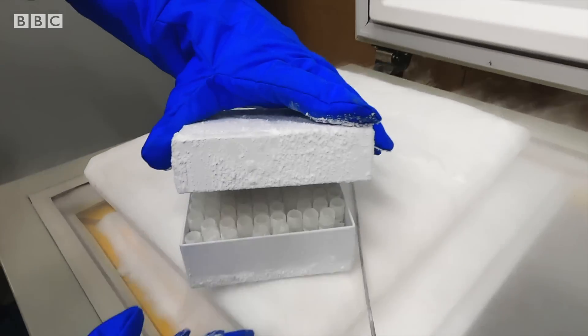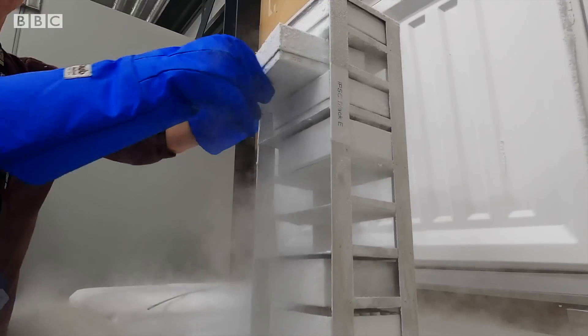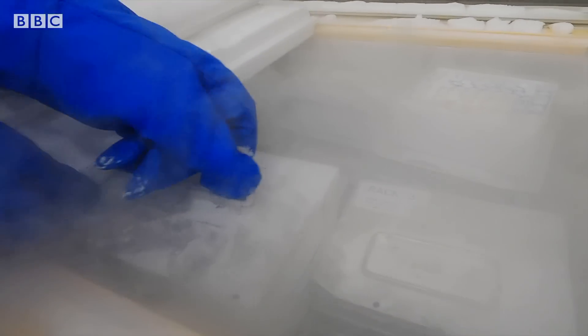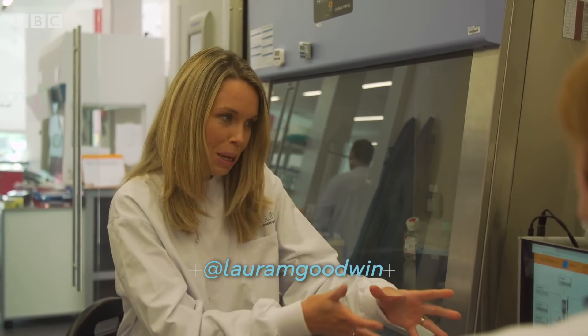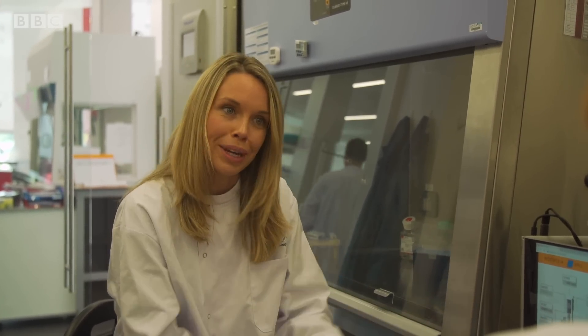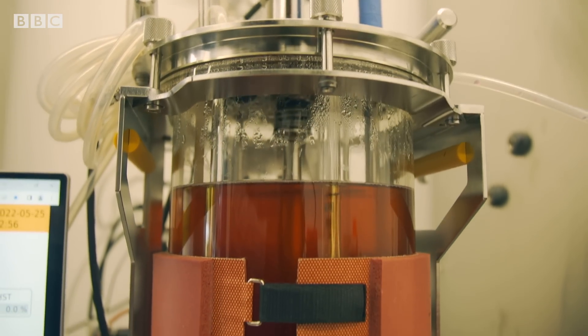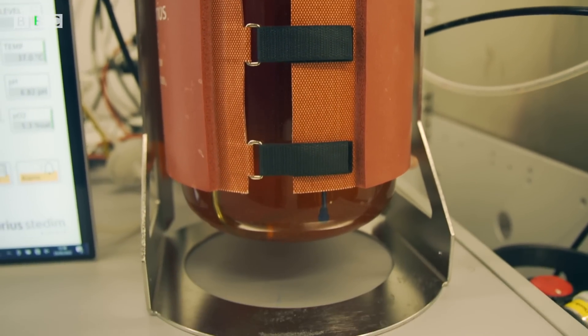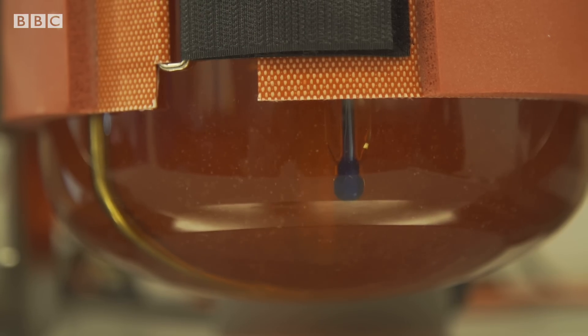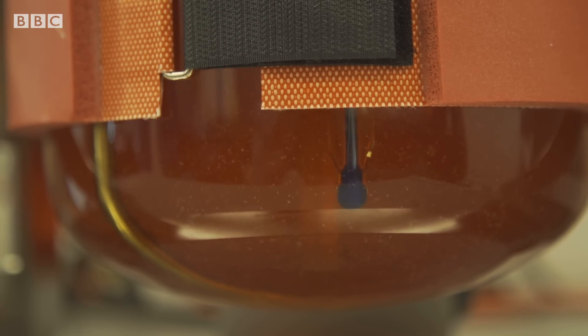The cells are frozen and packed, ready for shipping to lab-grown meat companies all over the world. We've come through here to see the next part of the process. This piece of equipment is a bioreactor, similar to what you get on a much larger scale in a brewery, for example, where you can take lots of cells and amplify them. Our goal here is to get as much mass as possible of the cells for the preparation of prototypes.